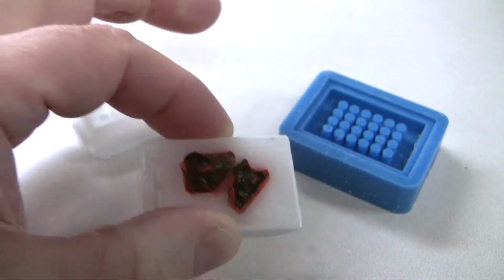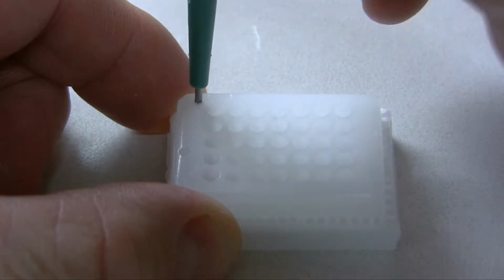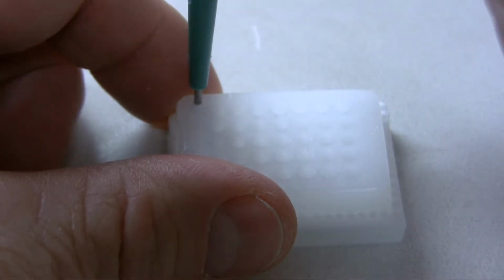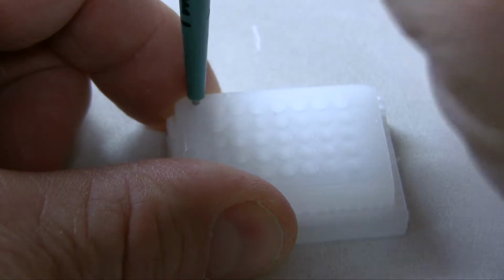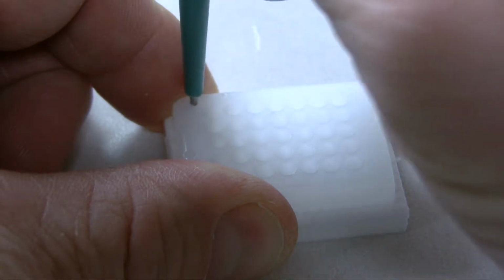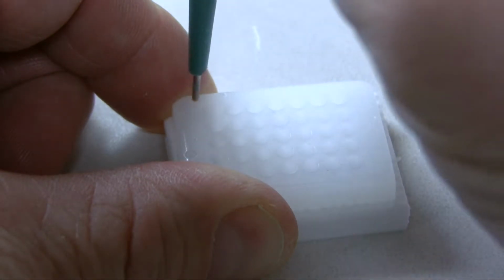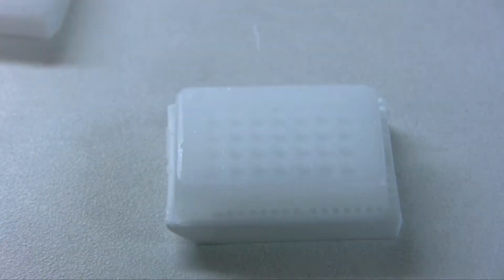We are using the 1mm and the 1.5mm needle for the location marker. Punch the array block with the 1mm needle. The outside diameter of this needle is slightly smaller than the core size of the 1.5mm needle. Try to make the diameter a little bigger as I am doing here so the punch from the 1.5mm needle will fit. Be very careful because this is where you could crack the block out.